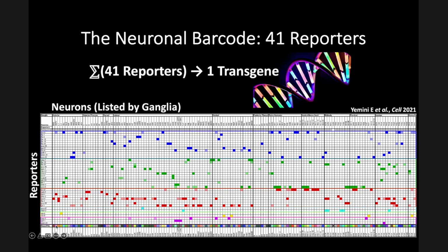And we'll return to this concept in a little bit, but the key thing here is that the color you're looking at is the live visualization of the identity of the neuron, because we have terminal identity reporters driving that particular color. And if the color gets altered for whatever reason, because the environment changed or we have a mutation, we'll know it, because we expect to see certain neurons of particular color in particular locations, and we no longer see them. So we know something went wrong. But all that we'll return to in a second. This spreadsheet here, this is the barcode, the live barcode that gives us the different neuron types.